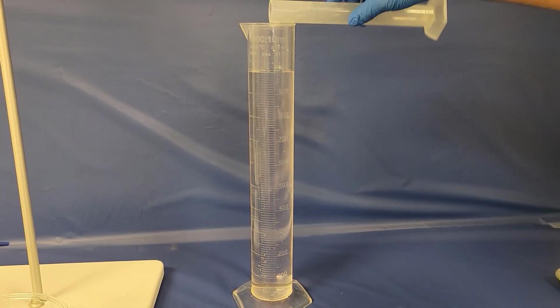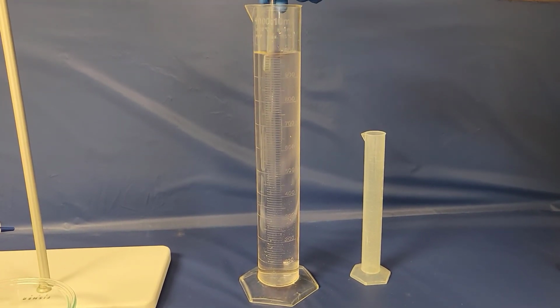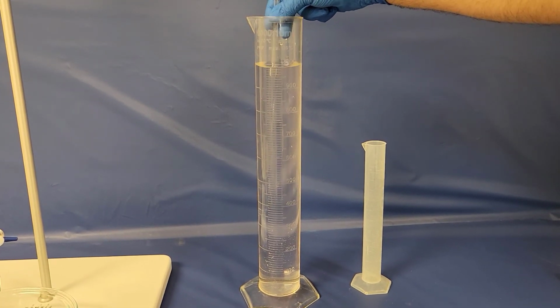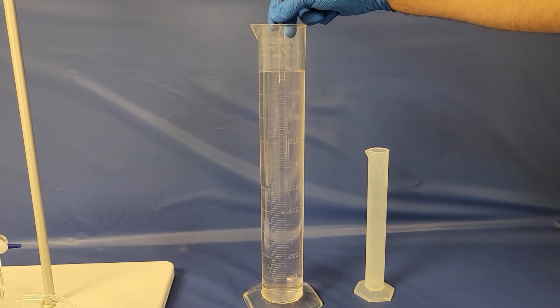All right, so now that we have our 100 milliliters of inferic mixed in, we're going to go ahead and stir this up a little bit, just to make sure we have a good solution.